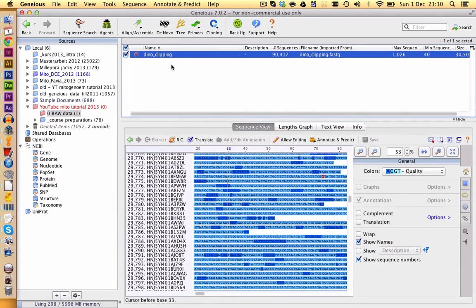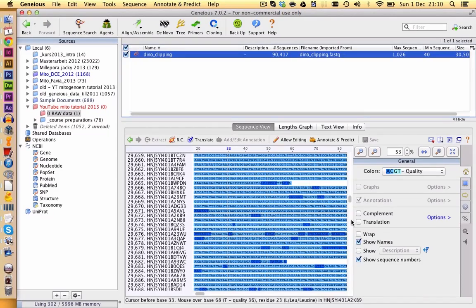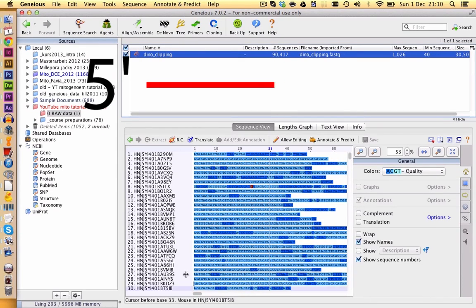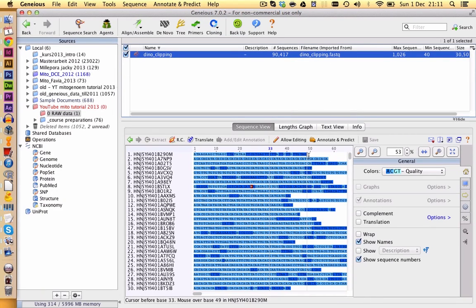Now I would like to introduce you to some common terms which you have for molecular data. So the first thing you should remember is that all your sequences always go from 5' to 3' end. So this here is a 5' end and this is a 3' end of your sequence.